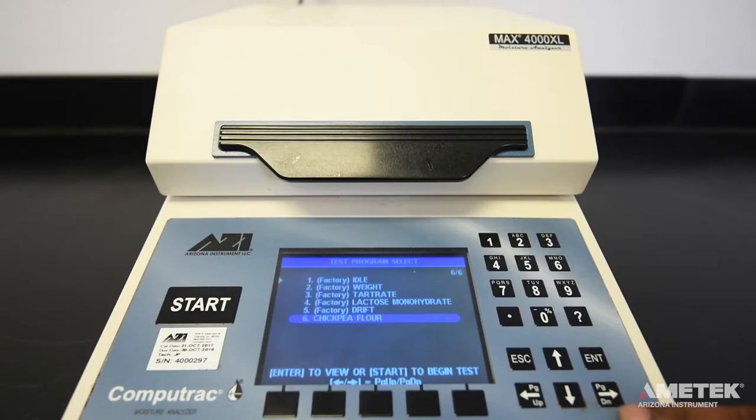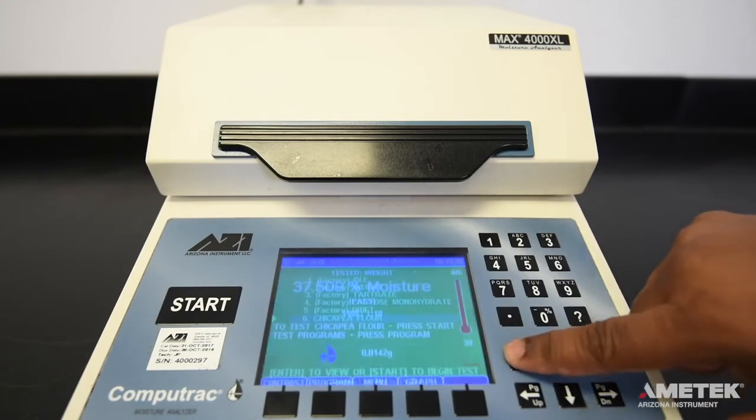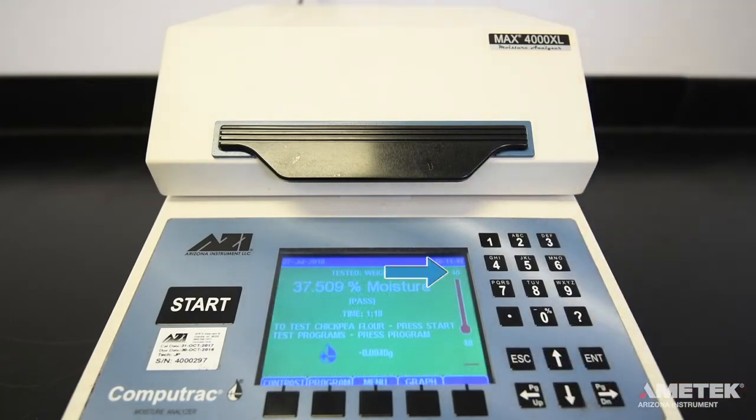Often the name of a test corresponds to the material you will be testing. When you have selected the correct program, press enter. This will display the various settings of the program. Press ESC to return to the main screen and you'll notice the idle temperature will begin to rise to the new idle temperature. The test line on the screen confirms which program will be used for the next test.